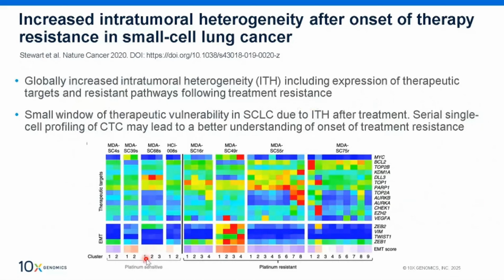This is before treatment, only 1 or 2 clusters, and after treatment, up to 8 and 9 clusters. This result suggests that the different expression profiles of different clusters could offer resistance to the drugs, and therefore their suggestion is that in the preliminary treatment, multiple drug combination treatment should be considered to prevent the rise of resistance in different clusters.